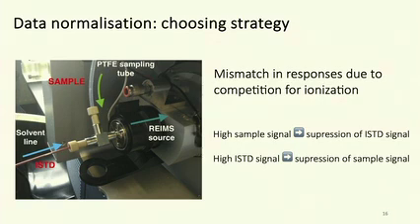So when we have a high sample signal coming from the ablation station, our internal standard intensity within our co-infused matrix has a very high chance to drop, and vice versa. And this is the mismatch between your internal standards and your sample intensities that can cause the disparities upon the variation. So a solution might be to use internal peaks for normalization, or spikes within the sample that will undergo the same ablation event, be captured within the same sample vapor and transported to the MS.